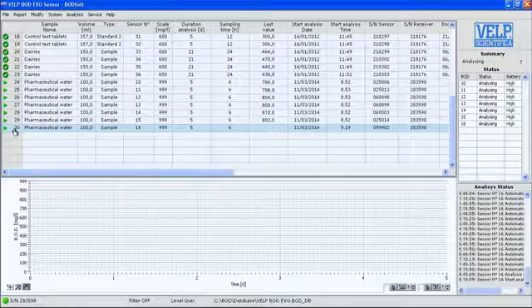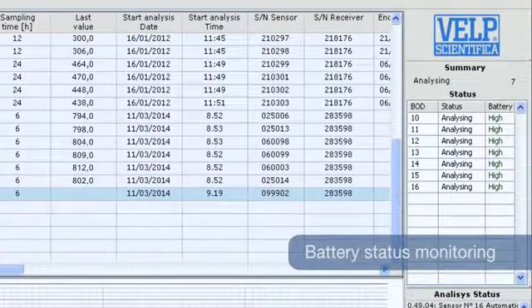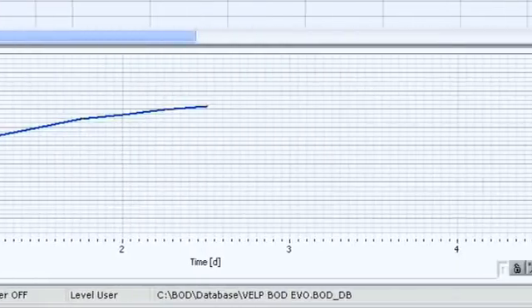All the most important info are constantly shown, including the status of the sensor's batteries and a database with automatic real-time graph creation.